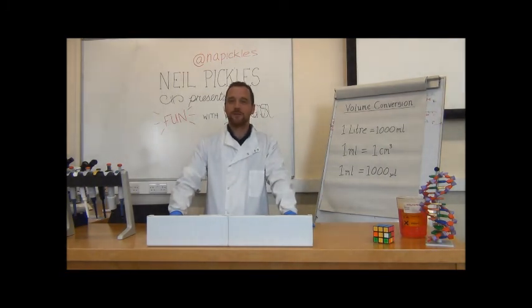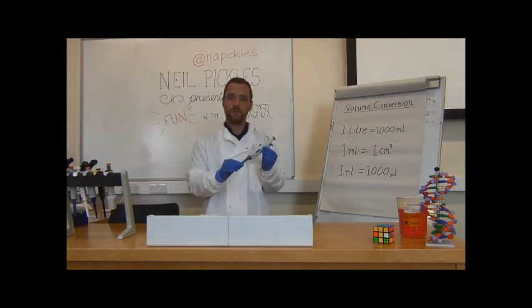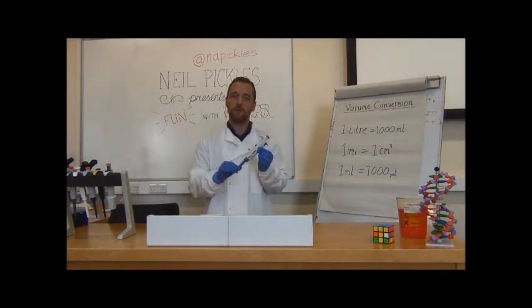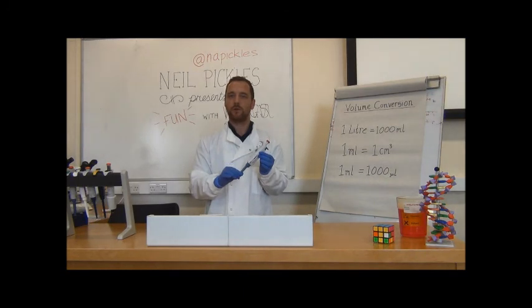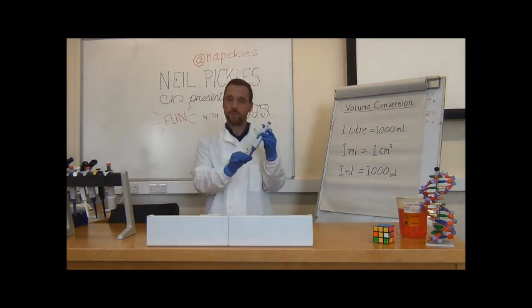The idea of this is to give you an introduction on how to use pipettes properly and safely in the laboratory. You'll be getting lots of experience using these, but the first time you use them can be a bit confusing and you may not be sure how to deal with them. So there's a series of videos coming up in which we will explain how to use the pipette, the different parts of the pipette, and how it works.